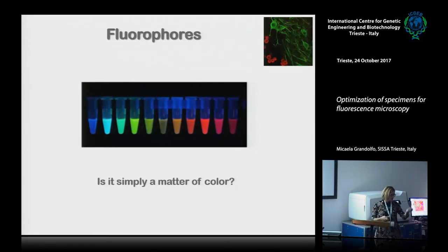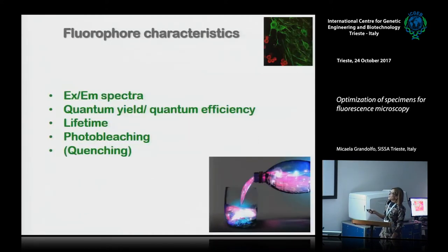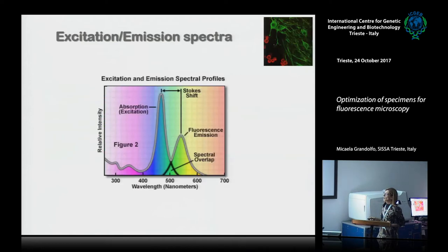You can say no, because you had a lot of information from Gabriele and Alessandro. But I would like to go through the characteristics of the fluorophore briefly, because you already know this information. Every fluorophore has a specific excitation emission spectrum, a specific quantum yield, or quantum efficiency, it is the same, a specific lifetime, a specific resistance to photobleaching. And then I will spend a few words on quenching.